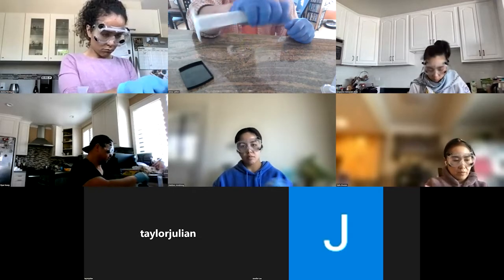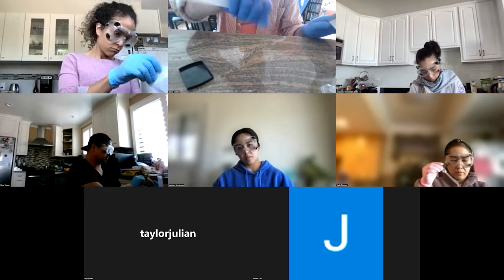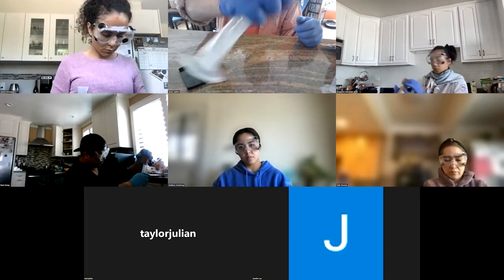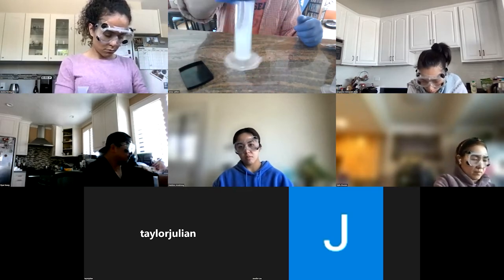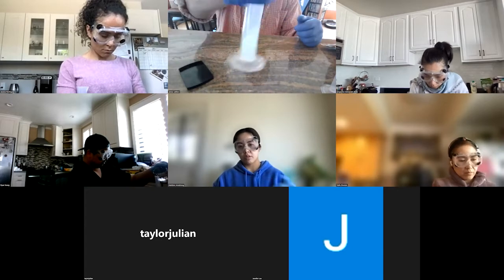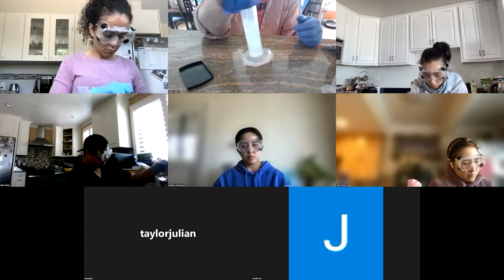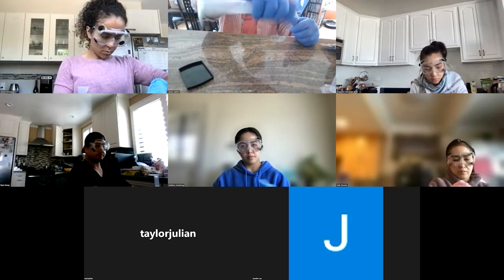If you noticed on the ingredients, both the calcium chloride and the magnesium sulfate were hydrates, which we did an experiment with earlier. Because they're hydrates, hopefully they will dissolve a lot faster. The anhydrous salts are really hard to dissolve, but if they already have water in them, they dissolve a lot faster. No, I still got big bits. It's taking a while.